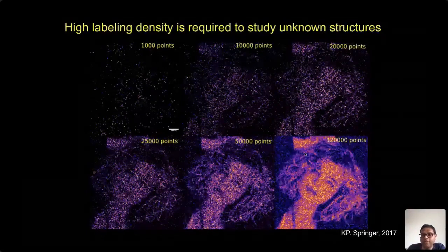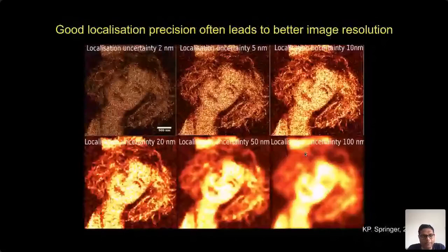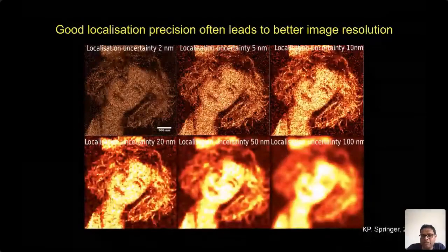And this is why DNA-PAINT is so popular. The other aspect, like for DNA-PAINT, right? You can get just any amount of signal, 2 million, 3 million. The thing is, you have to improve the signal density.